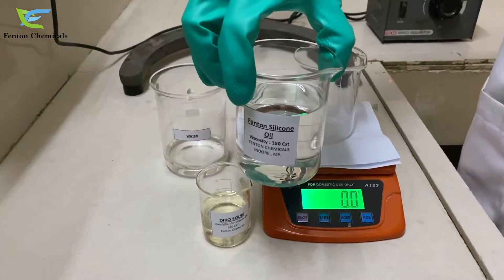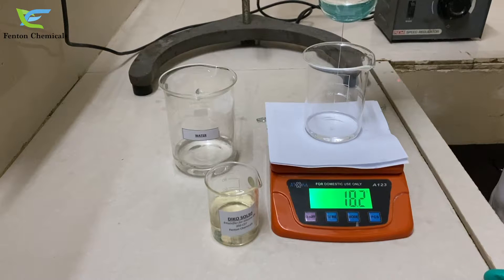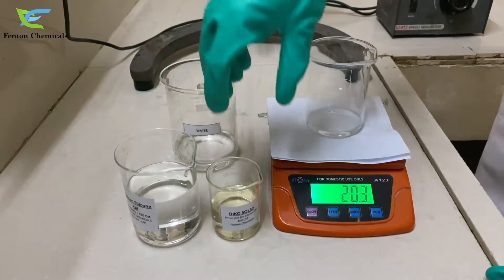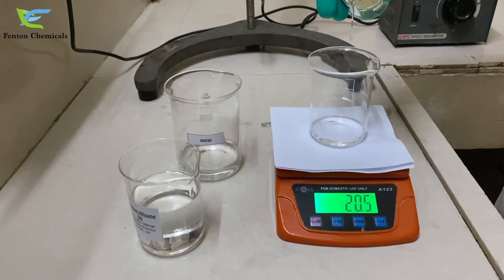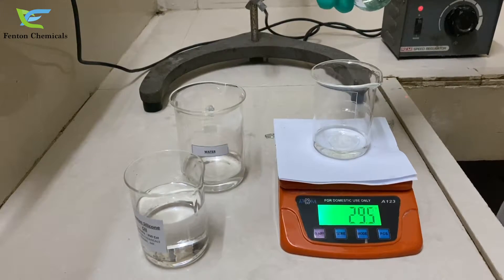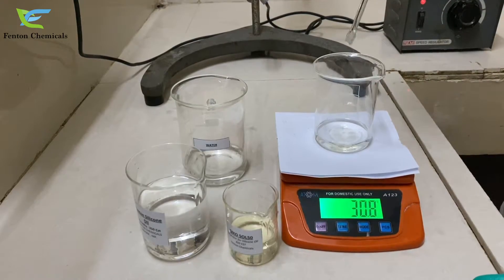First of all we will add 20 grams of silicone oil. Now we will add 10 grams of emulsifier Decosol 50 to it. Now we will mix the solution properly.